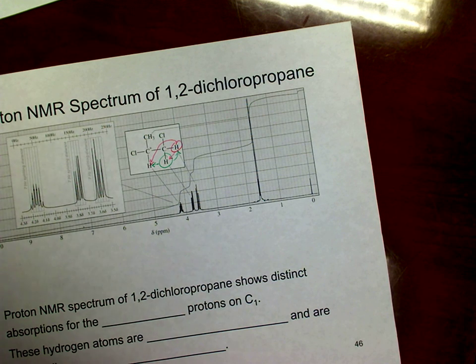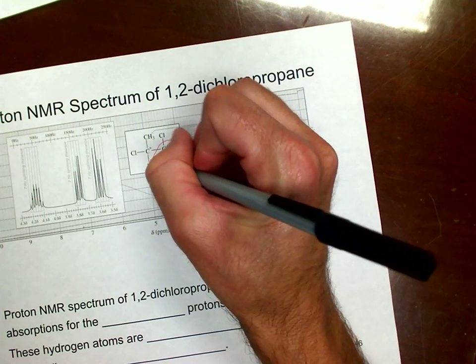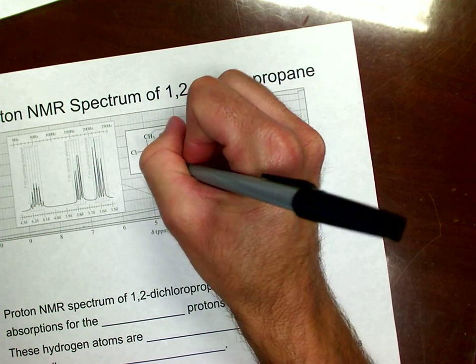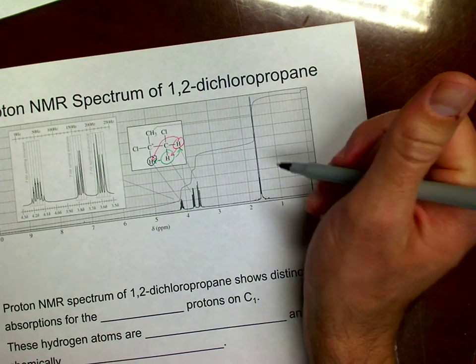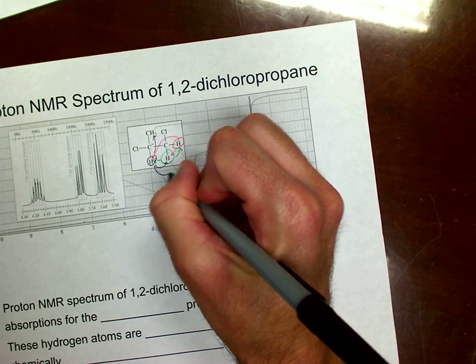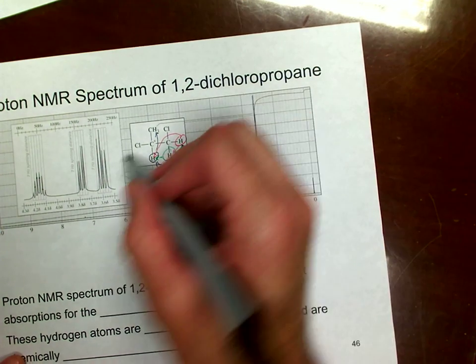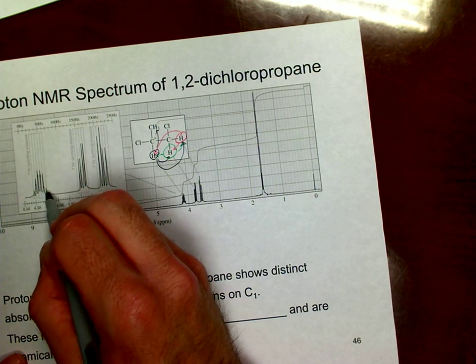Now, this signal here is seeing those 3, that one, and that one, and it is splitting them into a 1, 2, 3, 4, 5, 6.